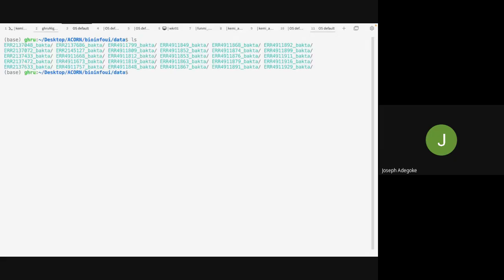So we are presented with this chunk of data with annotated data and then with numerous outputs. But we are told that we found out that this set of bacteria has this particular gene in their genome. So we want you to extract it and then want to know, are they the same, or we want to do a multiple sequence alignment to know if there is any difference in the genome of these bacteria. So how do we go about it?